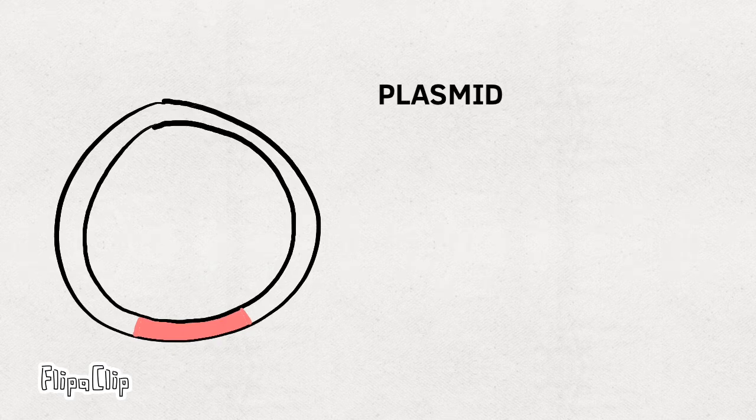Molecular cloning is a method to prepare a recombinant DNA molecule, which can replicate autonomously within a host. DNA ligation is used to physically join a DNA vector to our gene of interest, LC7A. With our pre-cut vector, we are going to insert our gene of interest.